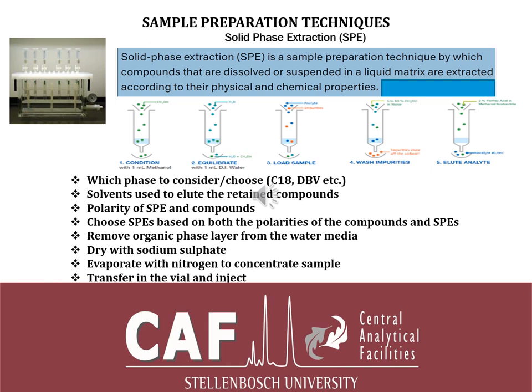Also now, like with the liquid extraction, if you had some water in your organic phase, you can dry it with sodium sulfate, and as mentioned earlier, you can evaporate with nitrogen to concentrate your sample either to completion or to a certain volume, and you can transfer it to a vial and inject. Or from there you can also do derivatization, offline derivatization, if you're not doing online derivatization. So there's a lot of opportunity for that.